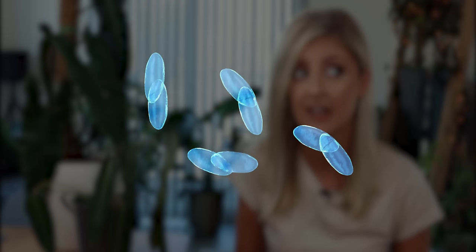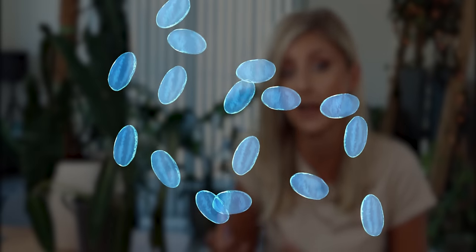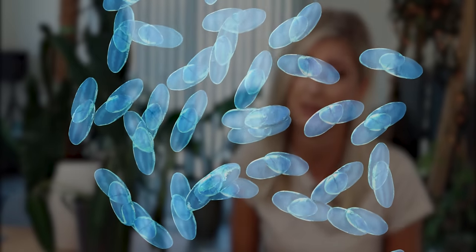A very quick note on sterility and just generally having sterile conditions. The environment that we use for tissue culture and the conditions that these plants are grown in is absolutely ideal for any fungus and basically mold. And the problem is mold and fungus will actually multiply quicker than any plant material in this environment can grow. So if we get any contamination in there, it's pretty much game over, because it's going to multiply quicker than the plant can, thus killing the plant material. So it is so important to keep things really, really sterile.